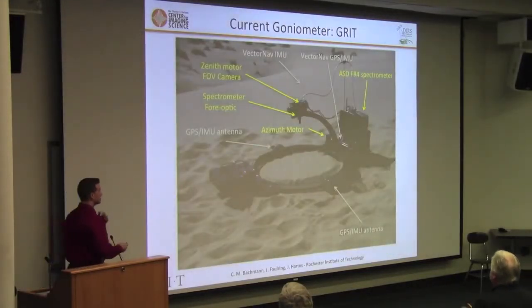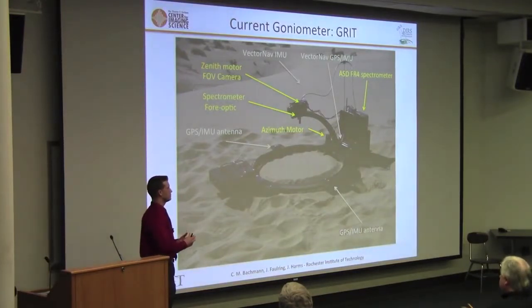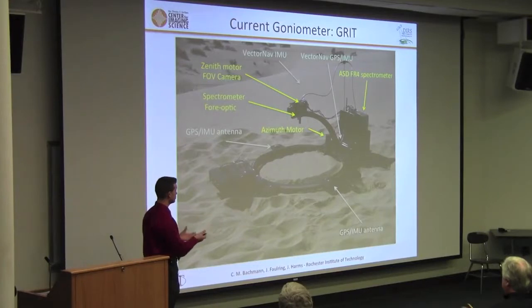Our device is made to measure sediments primarily, and we want to be able to hit every single point in the hemisphere. So we're trying to get something that will create a full-featured BRDF, if you will, with azimuth rotations, maybe at 30 or 15 degrees.